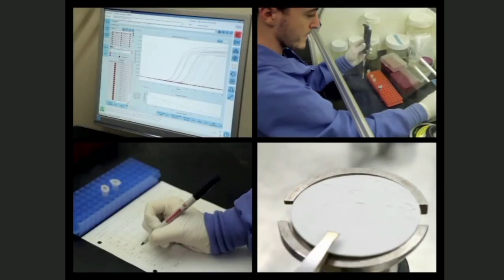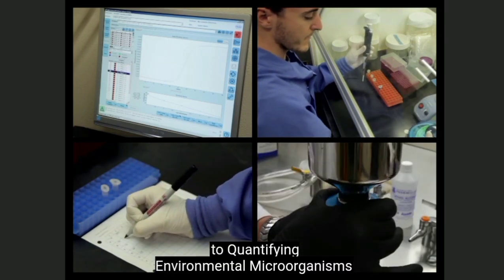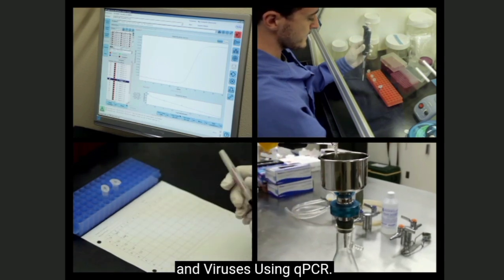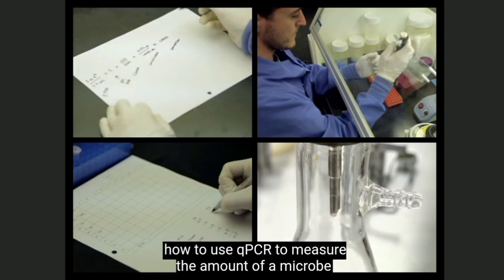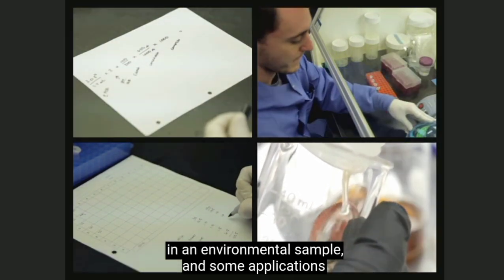You've just watched Joe's introduction to quantifying environmental microorganisms and viruses using qPCR. You should now understand how qPCR works, how to use qPCR to measure the amount of a microbe in an environmental sample, and some applications of this technique.